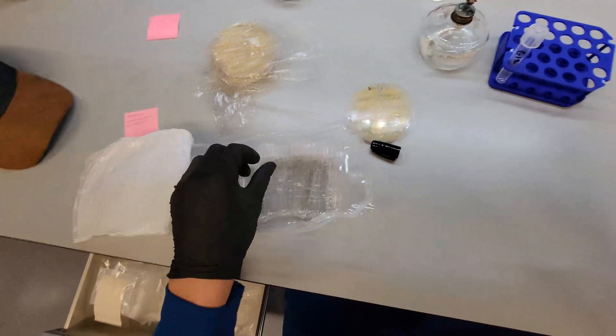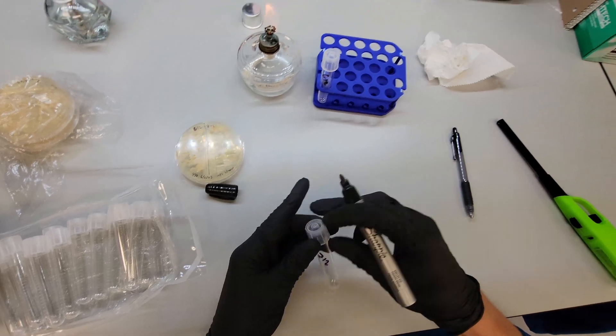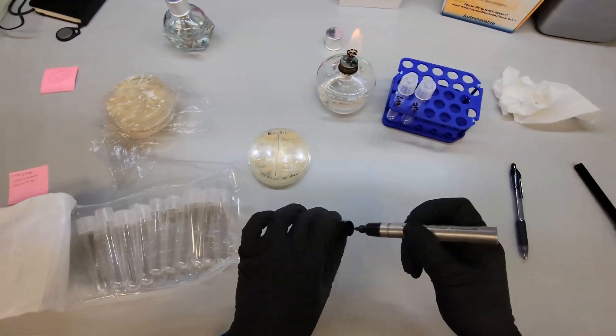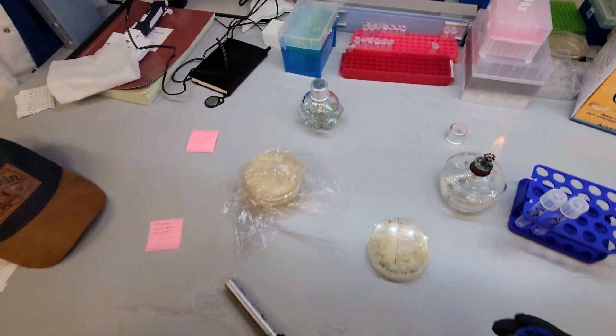So here's G12, here's Z12, and today we are going to be using YPD, YPD liquid culture. So that's this right here.